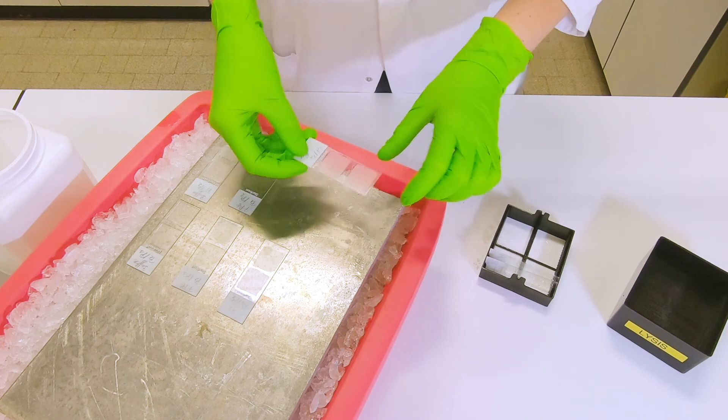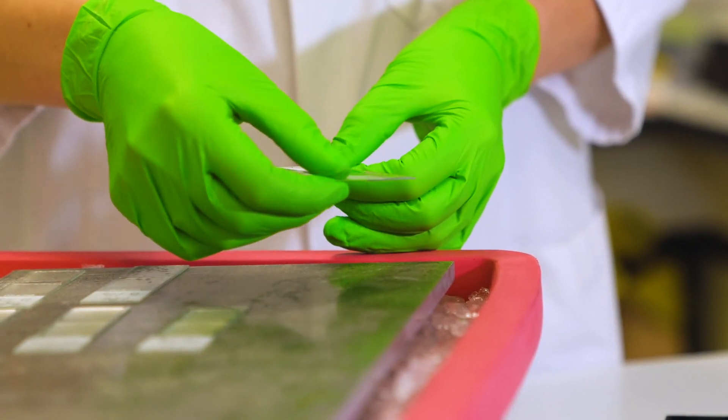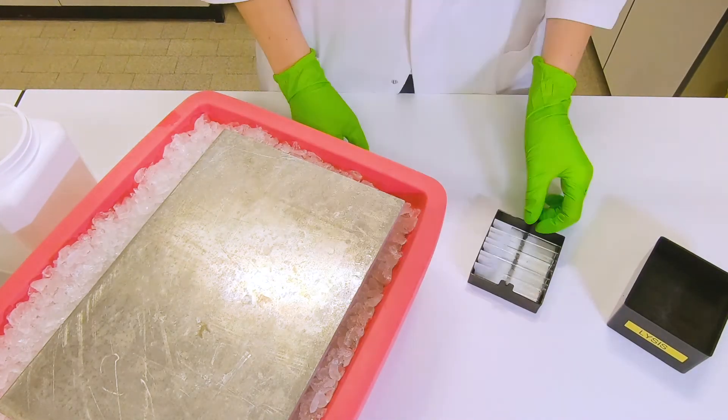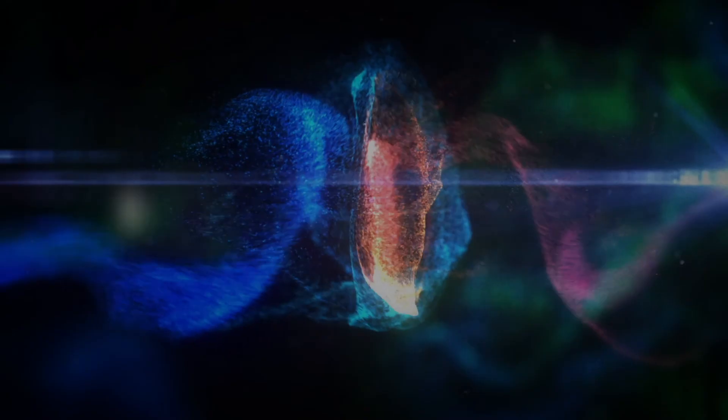In the case of the slides containing the 2 big gels, remove the cover slip and transfer them to lysis.